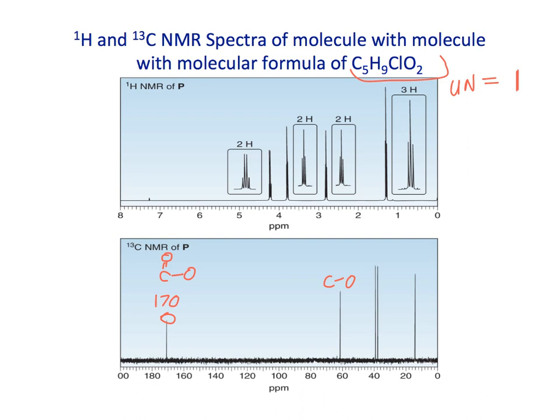The spectrum looks more complicated than it really is since it has all those expanded parts. So out here in the 3.5 to 4 range, this is where we would have carbon bound to some more electronegative group. Okay, we have oxygens and we have a chlorine to put in the molecule as well. So what else can we pick out here?